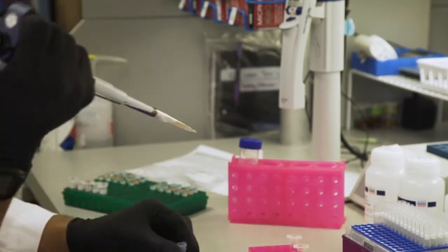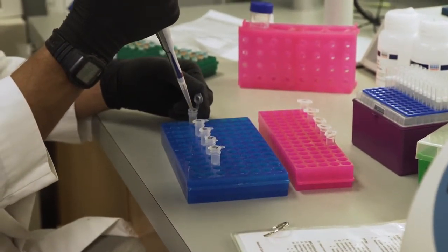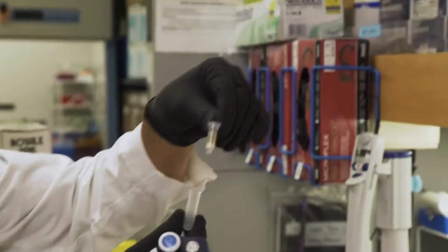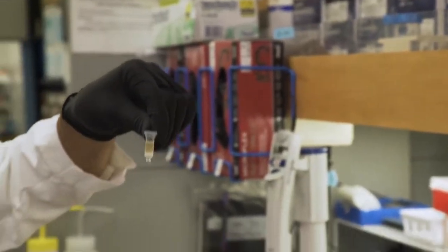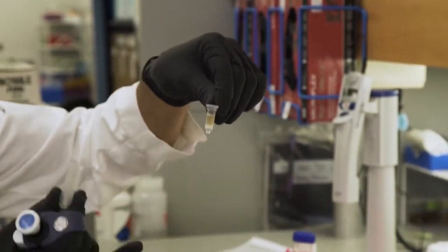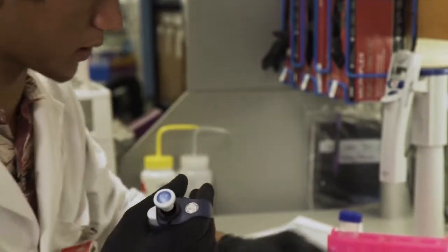And there's that. And there it is, added to our filter column. And it doesn't leak through because it's a really tight filter. If you notice, there's a hole on the bottom, but the only way to get the liquid through the filter is by using a centrifuge and spinning it really, really fast. So that's what we'll be doing here in a sec once I finish transferring all of these.